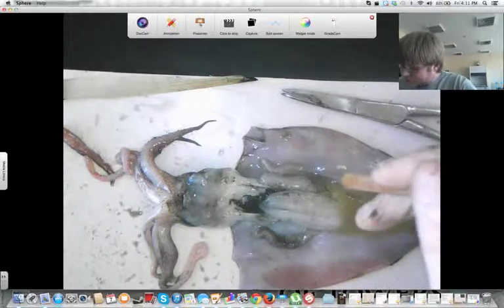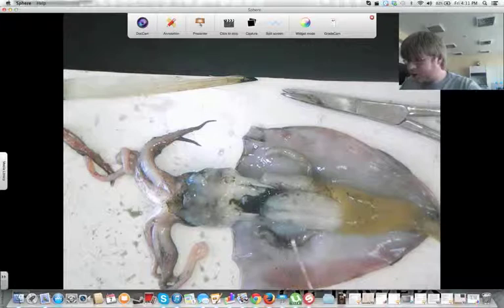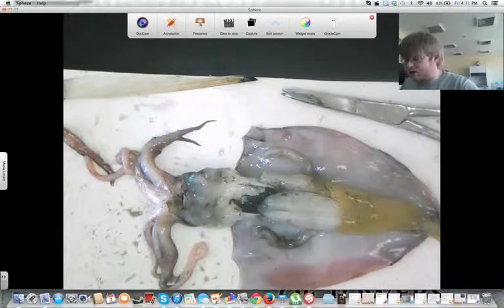Now, you'll notice that there are several different organs along your squid when you open it up inside. At the top here, we have the squid's two kidneys. Kidneys in humans are quite small compared to other organisms. In the squids, you'll notice that they are going to be quite large.